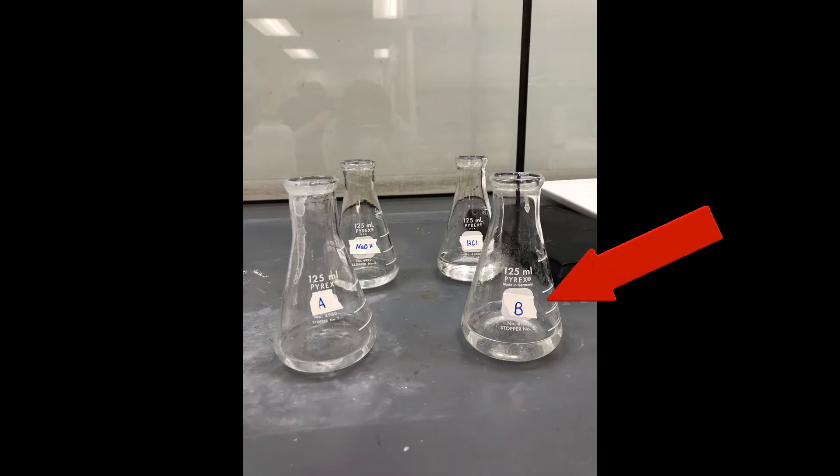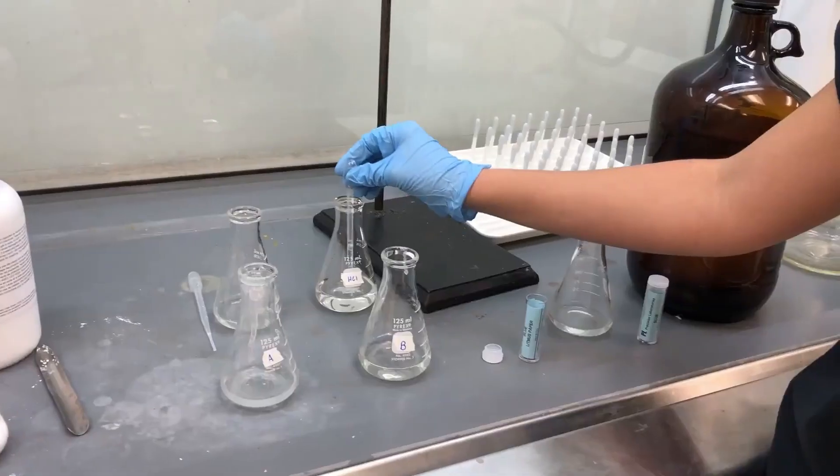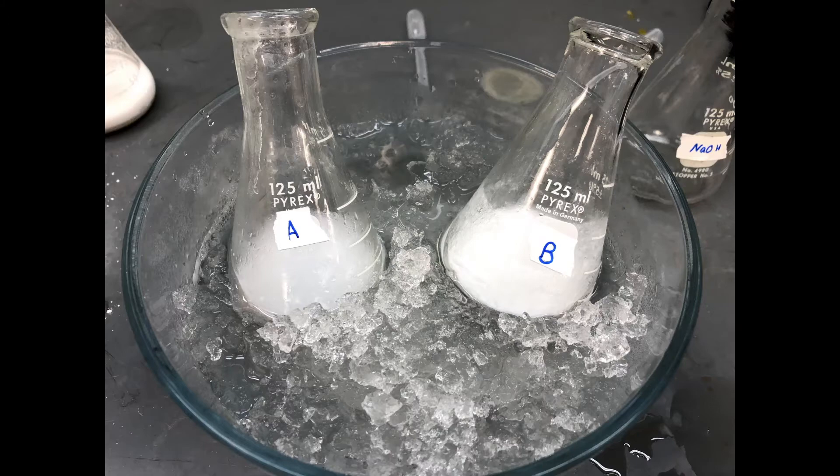For flask B, you will be doing the same thing as flask A, but with HCl to get the solution to a pH of about 2. If precipitate does not form, add more HCl. Transfer both solids into separate and labeled test tubes for later.